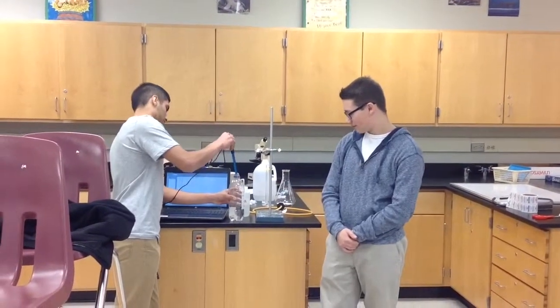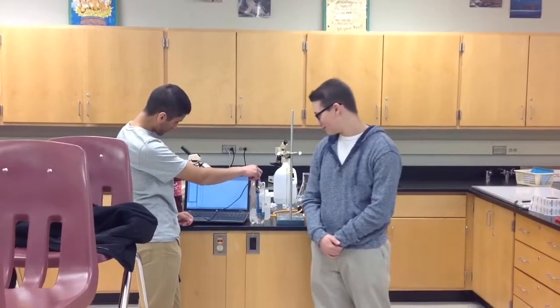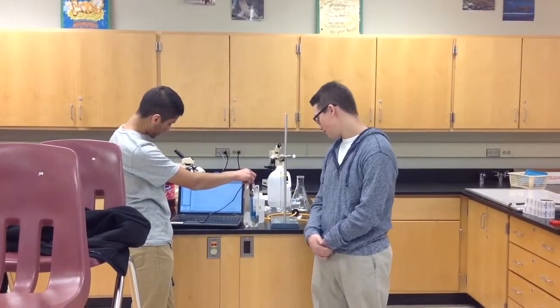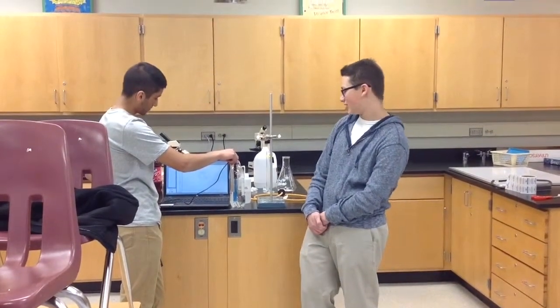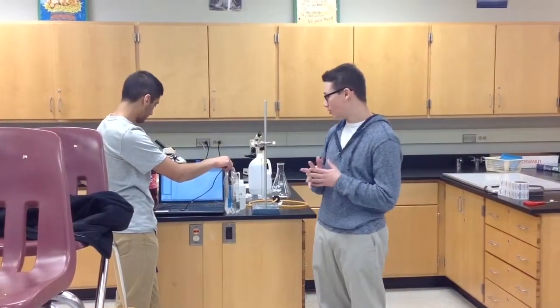And I'm placing the pH meter in the water. Just let it go for a second. And it looks like it levels out at 6.98 pH. So that's the starting pH of the distilled water we will be using.